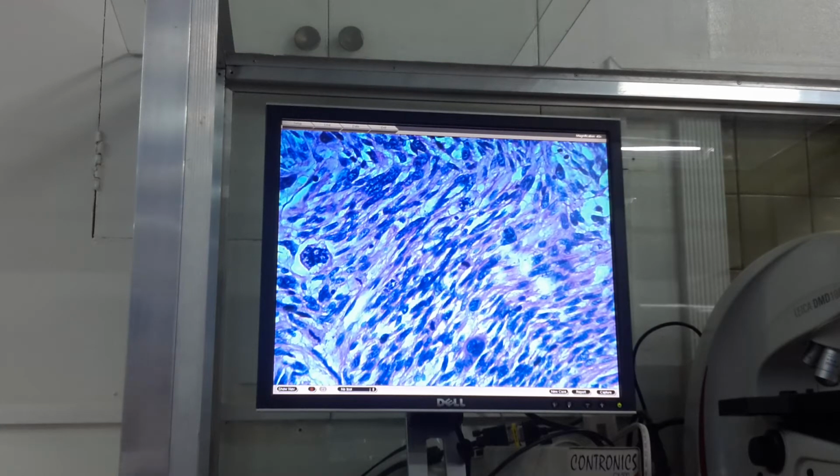Nuclear pleomorphism, hyperchromaticity, increased nucleocytoplasmic ratio, 1, 2, 3, 4, 5 mitotic activities in one high power field. That makes it an average of 50 per 10 high power fields. Tama? O, tingnan nyo yung grading nyo dun sa page 4.